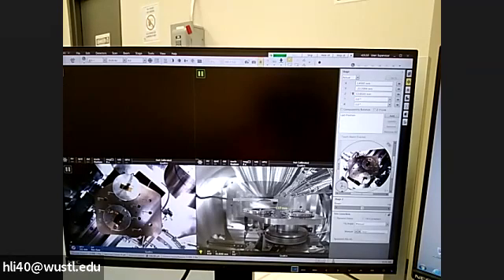So this is a navigation. Before we start the beam, we can do this type of navigation to locate the area of interest or your sample. Another thing I would like you to know is that this depends on the calibration. It's not exact, so it may be a little bit off the place when you click here.